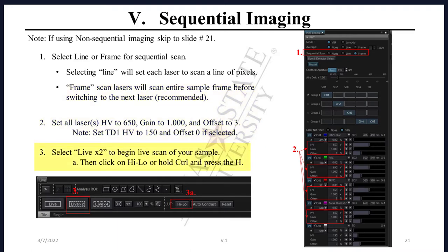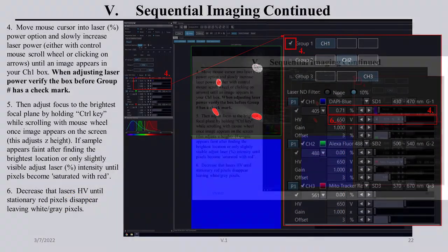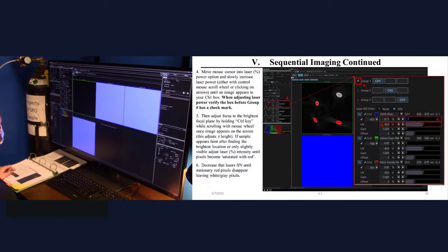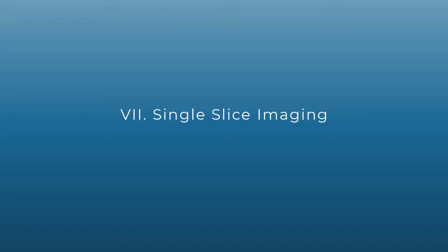Select Live Times 2 to begin a live scan of the sample. Click High Low. Optimize for saturation of pixels and then find the brightest focal plane. Decrease the HV for that laser until the solid red pixels disappear. Select the next group number and repeat the same process for each laser. If using transmitted light, optimize the HV. Once settings are optimized, click Stop to stop the live laser scan.